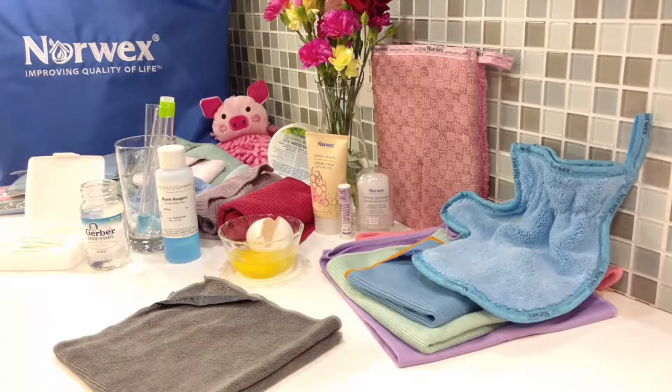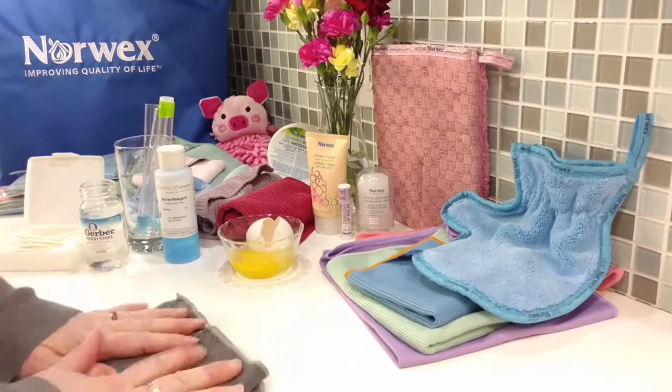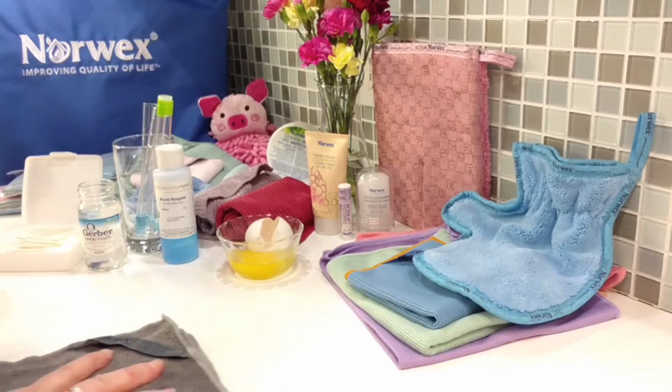Today we are testing the Enviro cloth using the Biuret reagent to see if it picks up the protein from the egg. So, first of all, we have our damp Enviro cloth. This is just water on here.